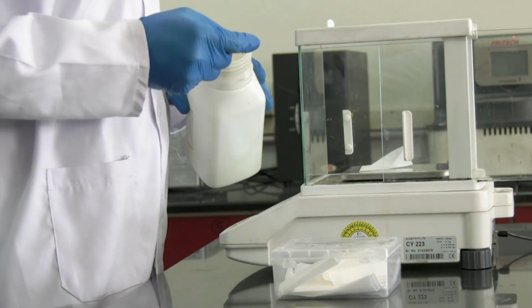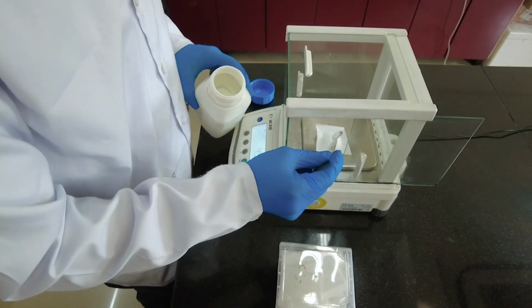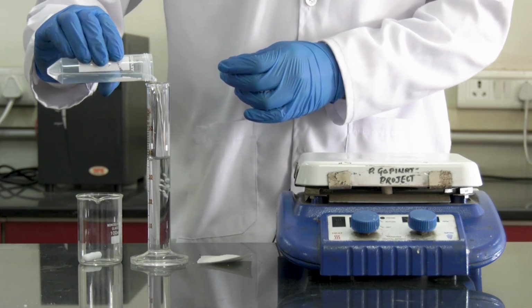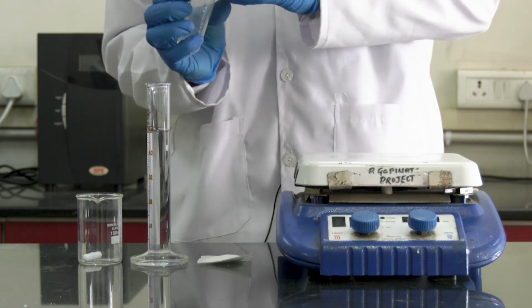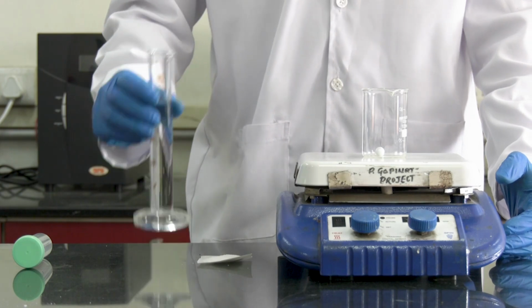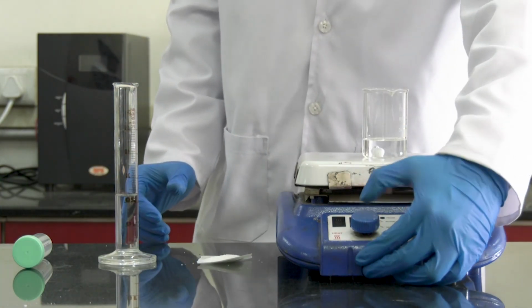We need to prepare a 10% polymer solution. So, we begin by weighing 5 gram of PVA. Next, measure 50 ml of ultra pure water. Place the beaker with the magnetic stir bar on the stirrer. Add some ultra pure water to the beaker and turn on the stirrer, setting it to 37 degrees Celsius and 400 RPM.